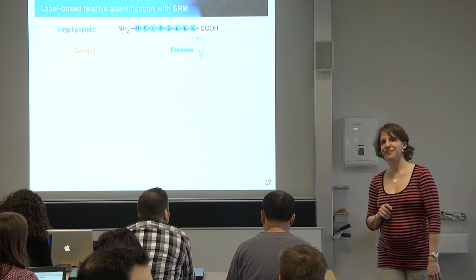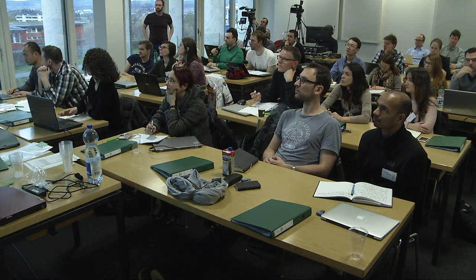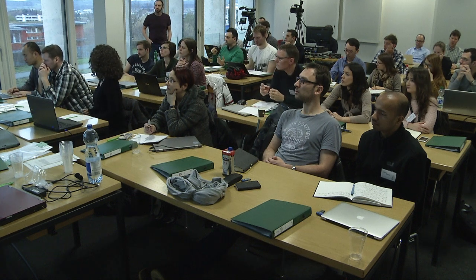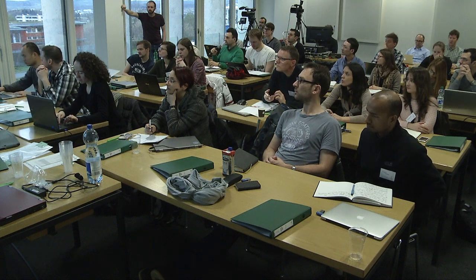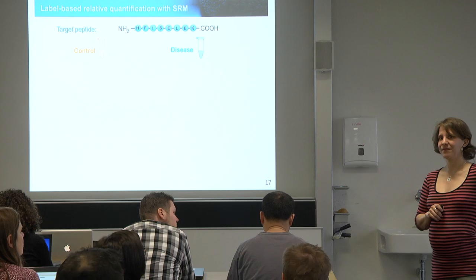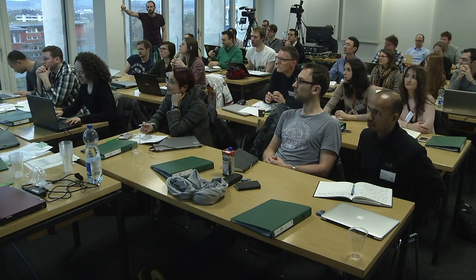Yeah? We need to spike a synthetic peptide or isotope-labeled peptide into both samples, and then compare the intensity we get in each sample to this peptide, and then compare them together. And what about the concentration of this that you spike in? It should be the same concentration in both. It doesn't matter how much it is. That's exactly what I wrote. Could be my phrasing. Exactly.